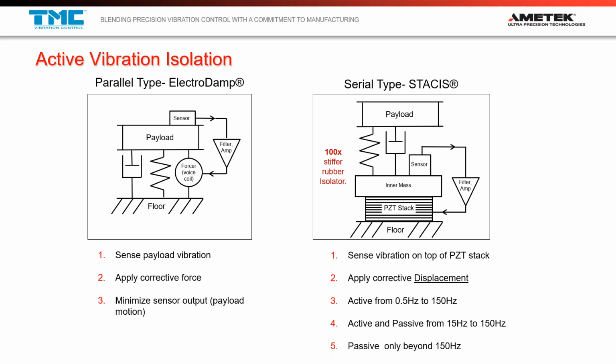We also see this accomplished using pneumatics, varying the pressure in pneumatic systems. And the one that we're going to focus on is the actuation provided by piezoelectric stacks. And the third component needed is some sort of feedback control system.